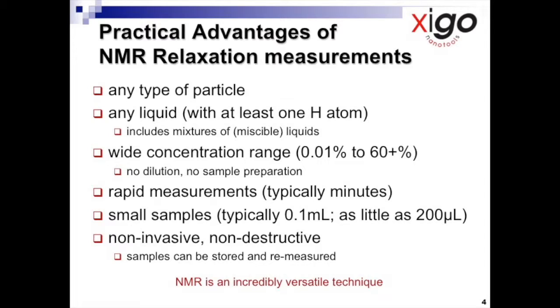What then are the practical advantages? First, any particle of any size or shape can be studied. It does not matter whether it is an active pharmaceutical ingredient. It does not matter if the particle is even a liquid. So you can work with emulsions and solid materials from alumina to zircon.